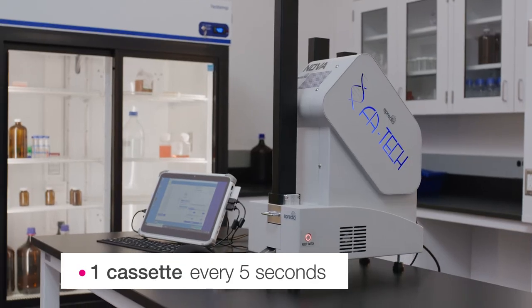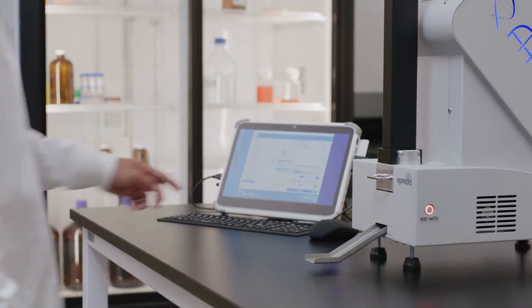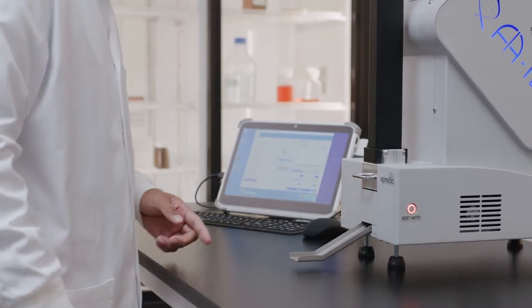With its fast printing — one cassette every five seconds — and ease of use, the Nova helps you increase productivity and improve laboratory workflows.